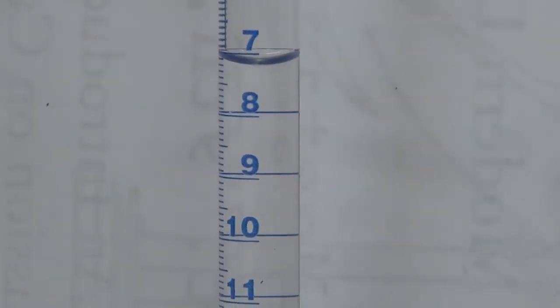That looks like 7.2, and that meniscus is right on the line, so I'm going to call that seven point two zero milliliters. So our starting volume of sodium hydroxide is seven point two zero milliliters.